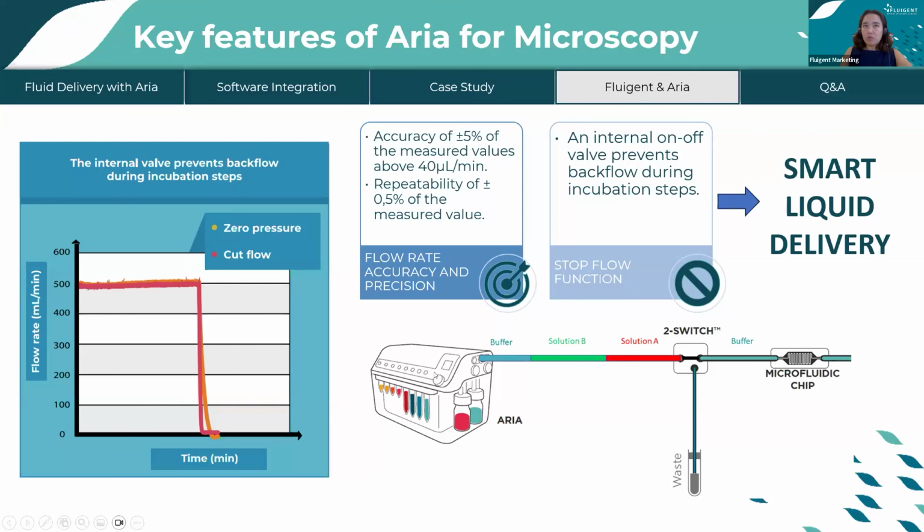It varies by 10 to 20 microliters of an internal volume. The total amount can be between 100 and 150 microliters until the chip inlet. So all of this is automatically calculated by Aria as a calibration when you turn on the instrument. And when you run your experiment, if you work with, for example, 150 microliters of antibody that you perfuse in your flow cell or microfluidic chip, the solution will reach the chip at exactly specified time and incubate for exactly specified time in the workflow.